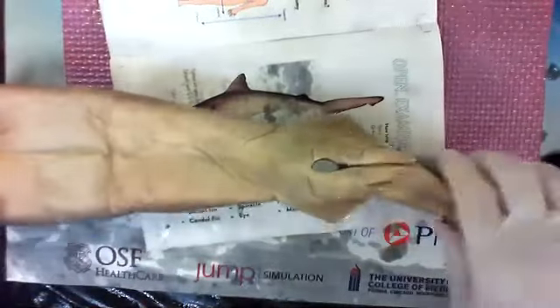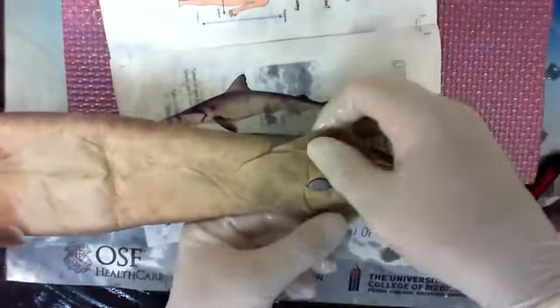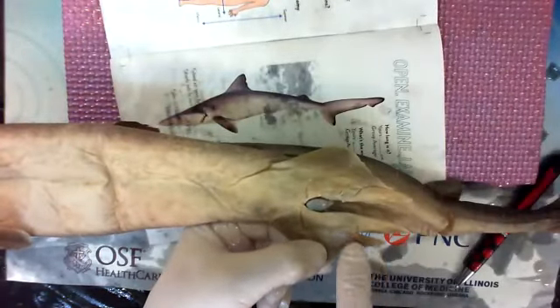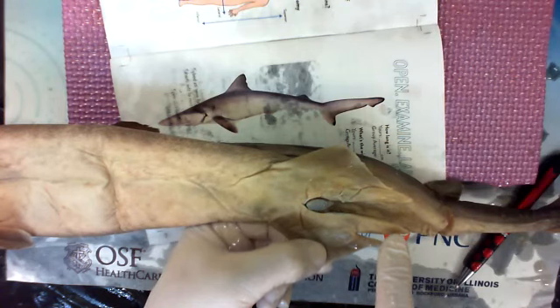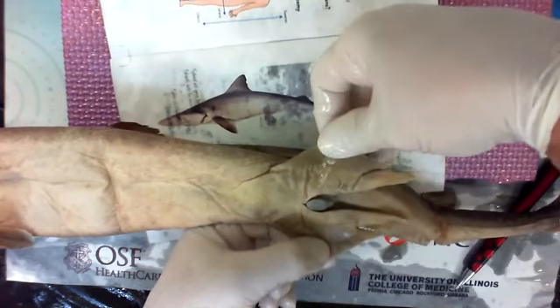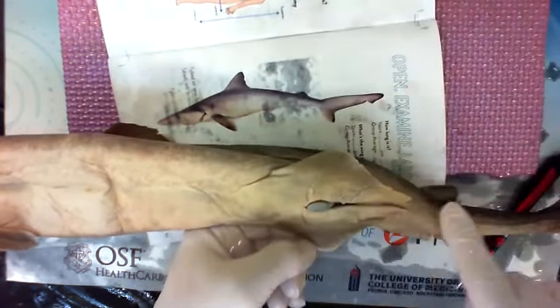It's a good time to say whether you have a male or female, so you can refer to your shark appropriately. On the pelvic fins, if there's a second, see that split right there? And it looks like a second fin coming off, it's a boy. See it? Same way over here, there's a split. Girls won't have that. Girls will just have this fin and it comes straight, no splits.